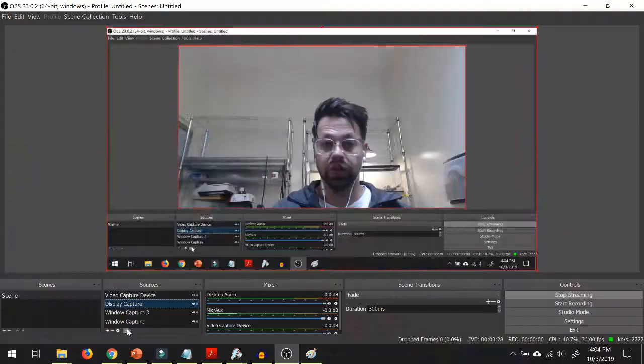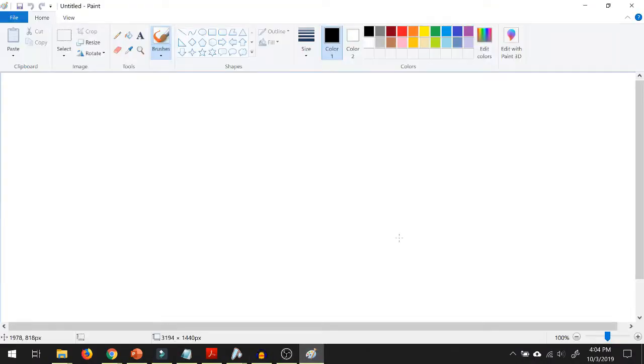Then, if you haven't already, make sure that you download SnapGene. SnapGene is what we're going to use later today to look at what's actually inside of plasmids and how plasmids work and all that good stuff. So while you're following along today, go download SnapGene. SnapGene Viewer. It should be free. All right.